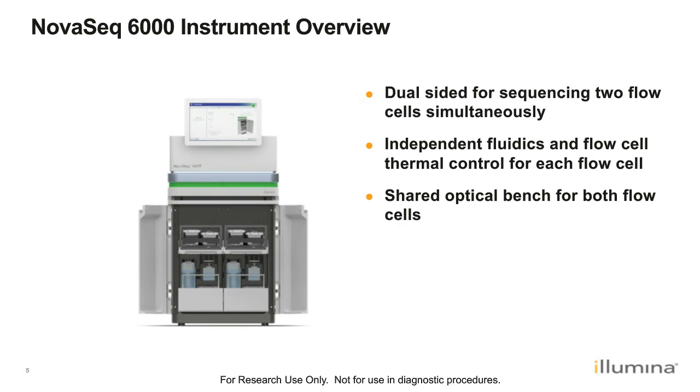Moving our way down from the optics is the dual activated deck or flow cell stage, where the flow cells are loaded for sequencing. The NovaSeq is able to run 2 flow cells at a time, exactly like our HiSeq platforms. The flow cell stage fully automates the flow cell loading process, such that all you will need to do is place the flow cell on the deck. The deck will automatically clamp the flow cell securely in place, as well as applying vacuum and biases it to the exact position for imaging.